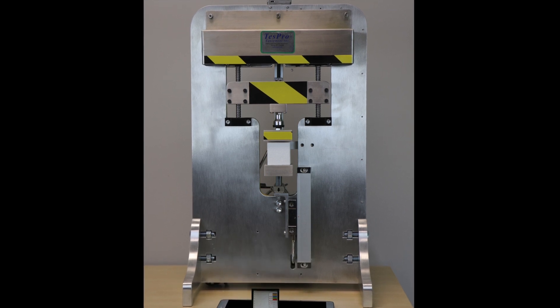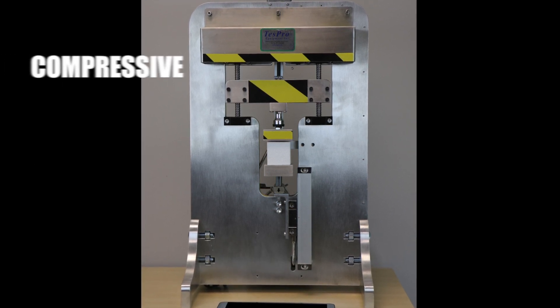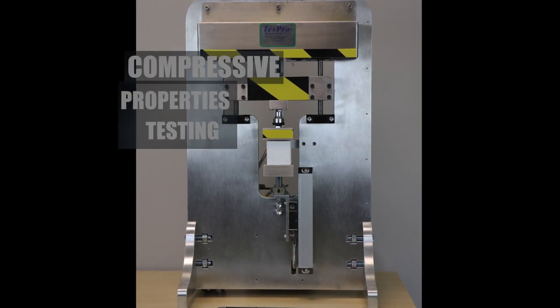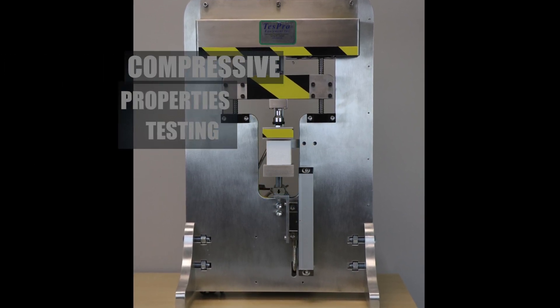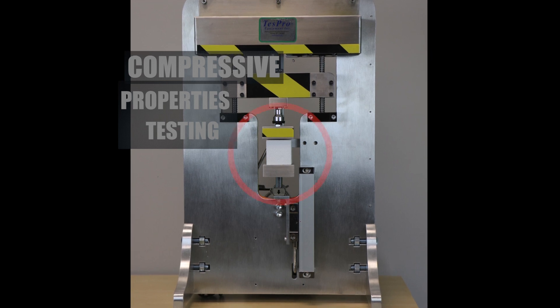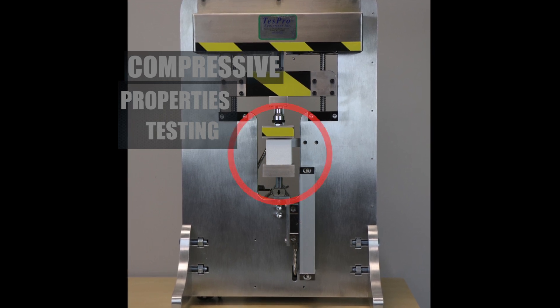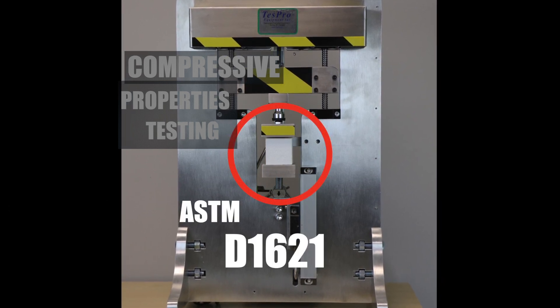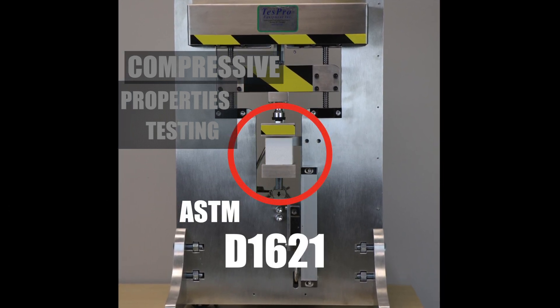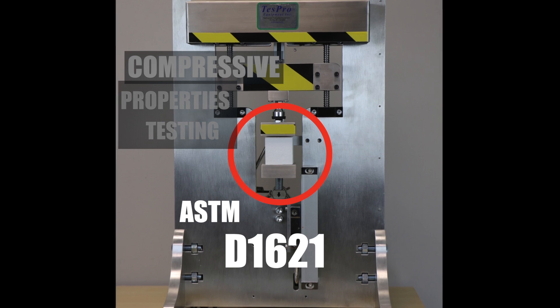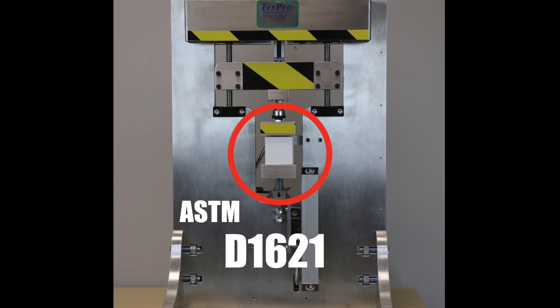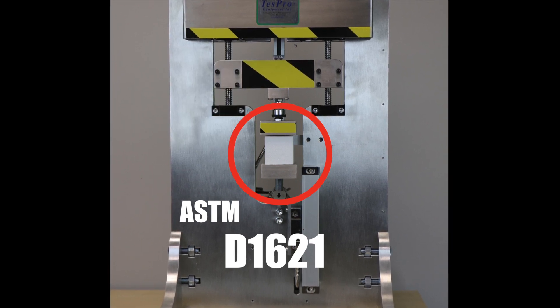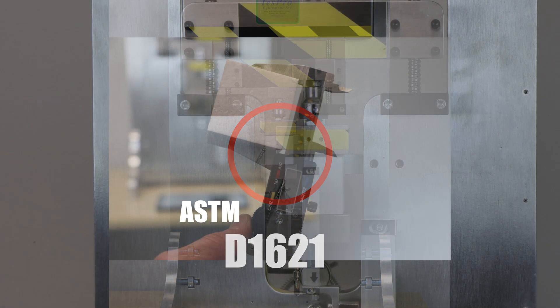This apparatus is sized and configured to perform compressive properties testing on expanded polystyrene foam in accordance with the specifications of ASTM D1621, standard test method for compressive properties of rigid cellular plastics.